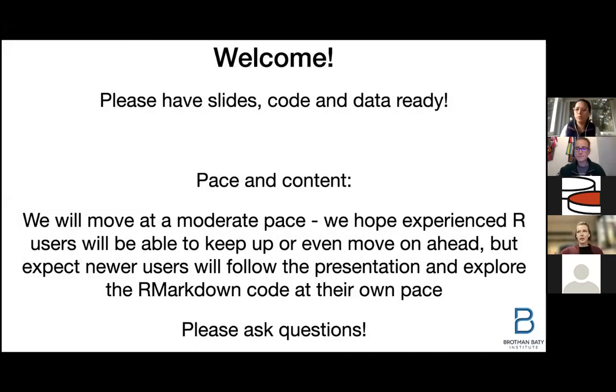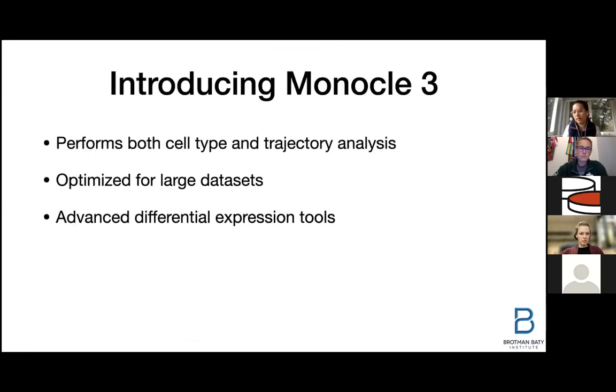All right. So I hope that all of you have all the slides and the code for today in the form of the markdown and the data file that I shared ready with you. We will move at a pretty moderate pace, and if you're an experienced R user, you're free to move along through the R markdown and go ahead and finish it and then just listen to the presentation. Or newer users can go on doing it with me and explore the markdown at your own pace. And please ask questions in every section.